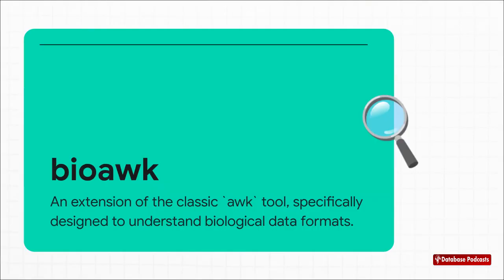This is where Bioawk becomes your new best friend. It's built on top of a legendary tool called Awk, but you can think of it as Awk that went and got a PhD in biology. It's a text processor that already understands the structure of the most common bioinformatics file formats, which just takes all the painful guesswork out of trying to parse them yourself.